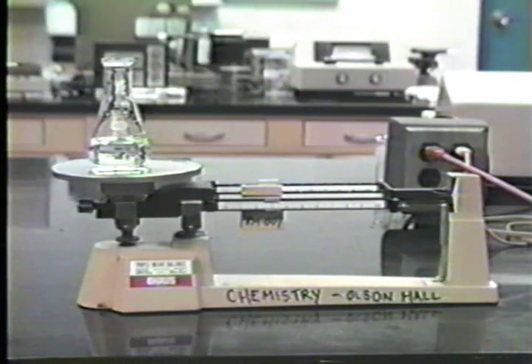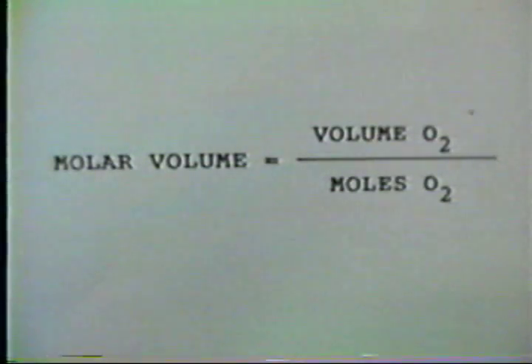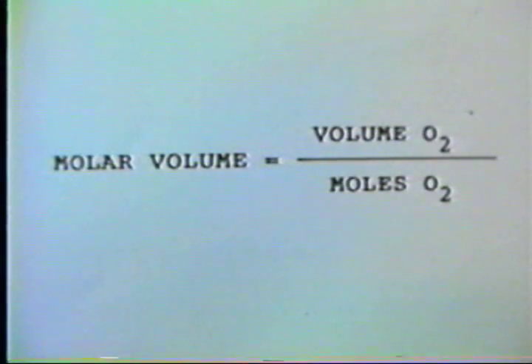You finally weigh the flask and the remaining water. Well, except for a couple of weighings and a temperature measurement, you've seen the entire experiment. Of course, you'll be running a duplicate run as well.